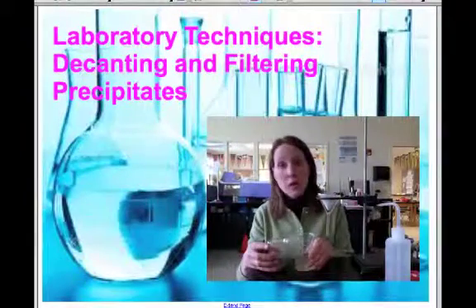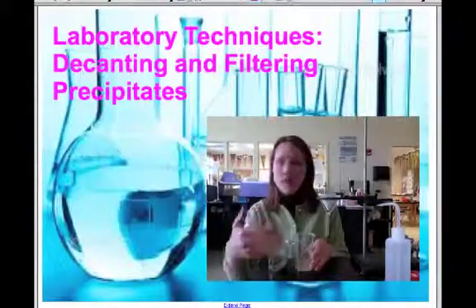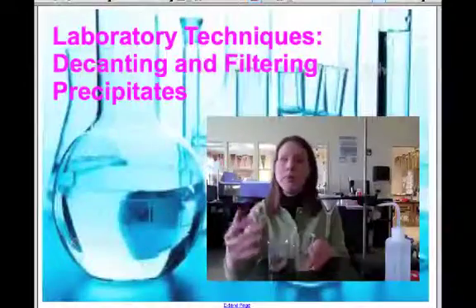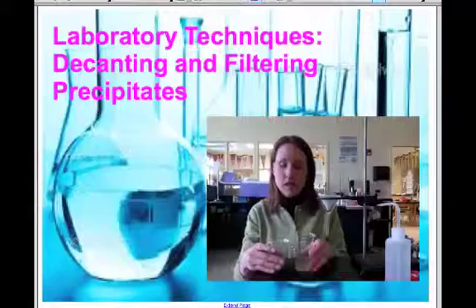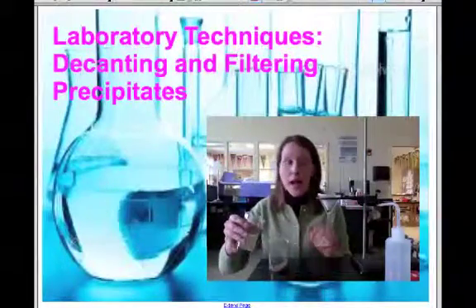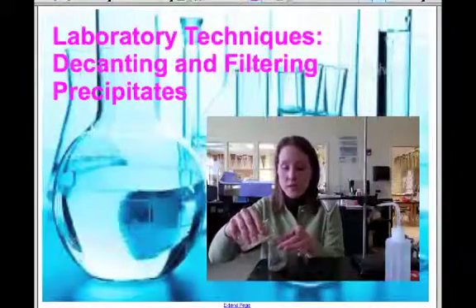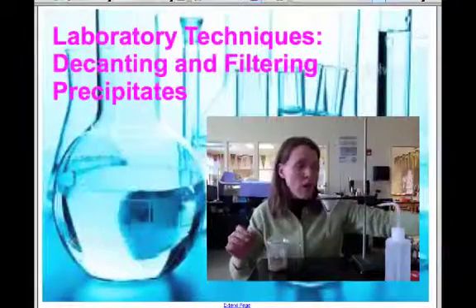Now, in your experiment, you will be doing some rinsing, and you will be taking a lot of deionized water, and you're going to be rinsing your precipitate and repeatedly decanting in order to complete that rinsing process. So I'm not going to go through all those steps with my lovely sand here, but I am going to show you our very last technique. I'm going to add just a little bit more water back into here.